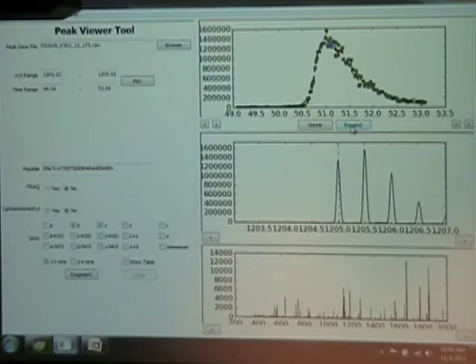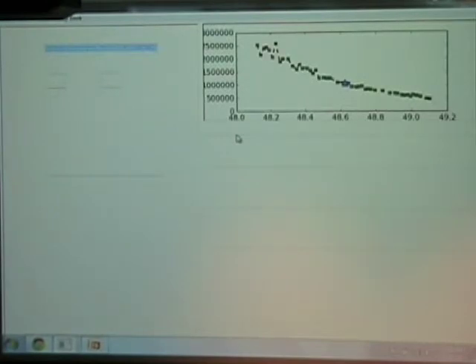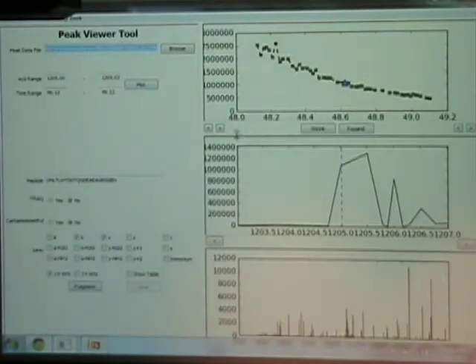It's not just interactively looking at something stored in the database, it's actually collecting data on the fly from the raw file. And as a matter of fact, if you don't have the file with you, it will try and connect through the web using the MZ server. If you have an MZ server that's hosting this file, so now what this tool is doing is it's going to our server and collecting the data.